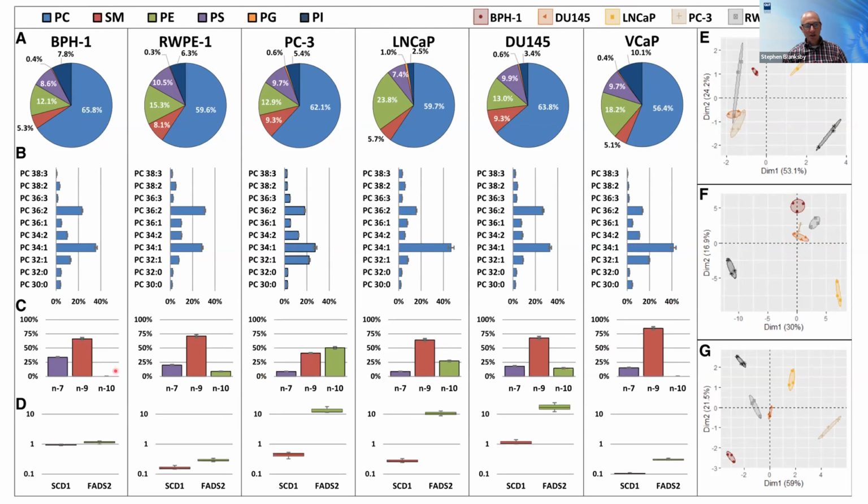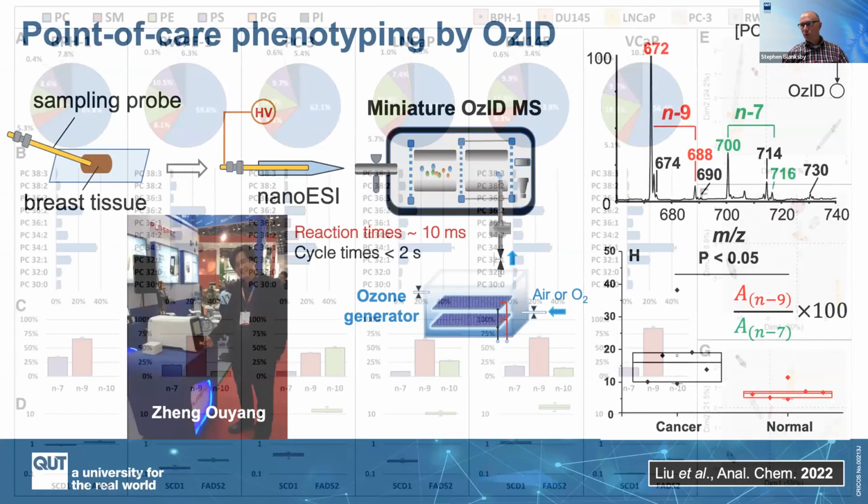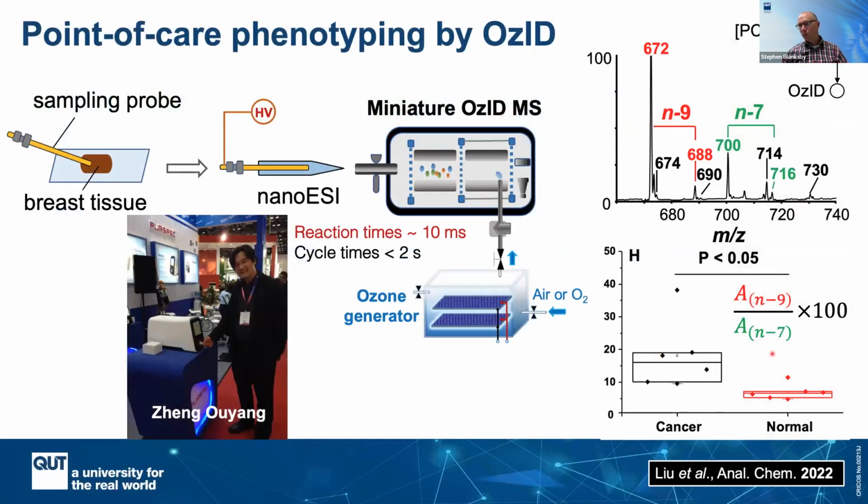If we look just at the unsaturation profile, just of that one monounsaturated lipid, that PC34-1, we actually see quite stark variation. So it becomes a real phenotype of these different cells, just the pattern of unsaturation carried by that major monounsaturated membrane lipid. And you can see that here in the PCA plot, that these things then splay out really nicely in phase space. So in terms of being a phenotypic marker, we're quite excited about using these double bond profiles.